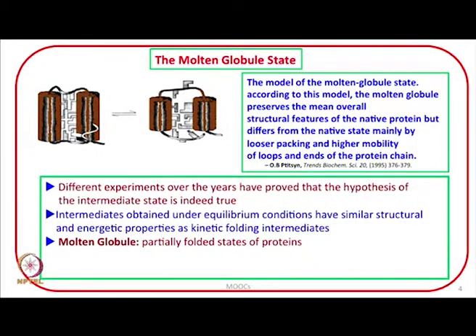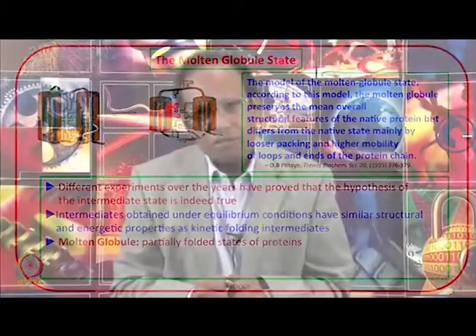Molten globule, partially folded states of proteins. Let us discuss what is a traditionally accepted definition of molten globule state.